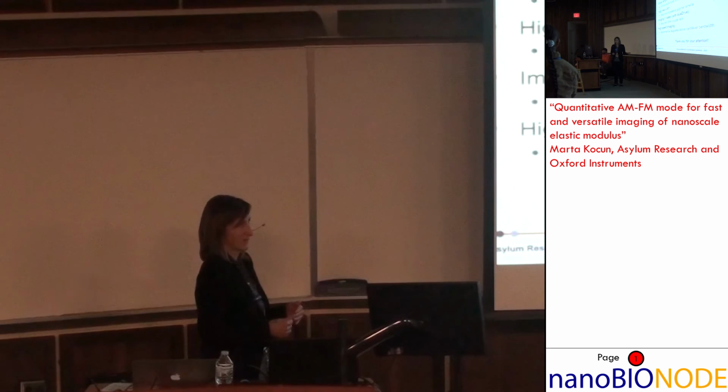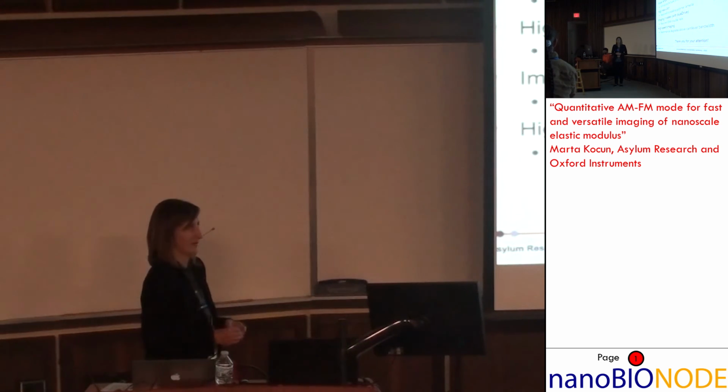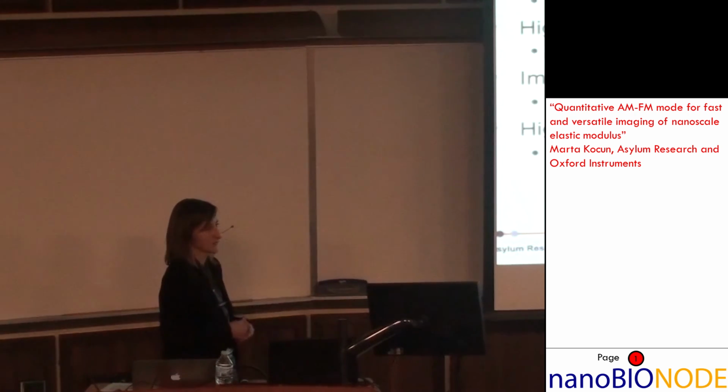So yes, I think that using blueDrive, you get a more precise reading from the beginning, so you might get a more exact number for your modulus. But in terms of having relative modulus values, I think it should be the same.